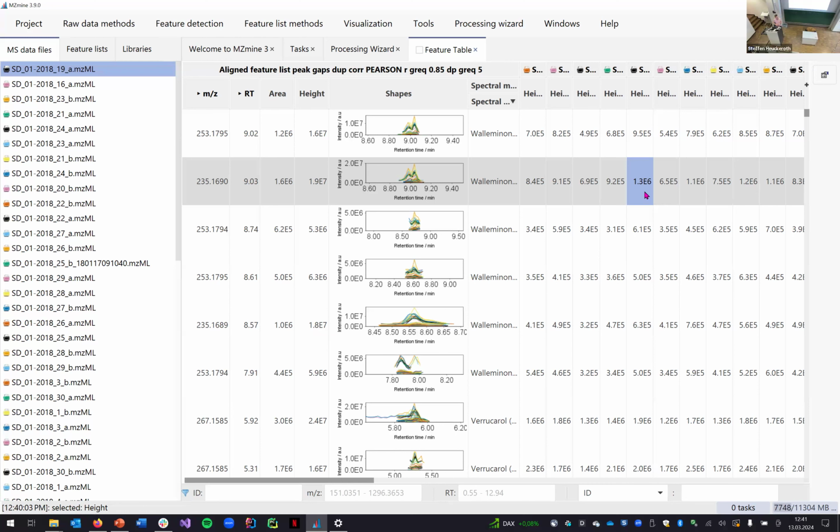I will write that down and keep that in mind for future developments. If I got your question, what you're asking, because you're an XCMS person, I see it. And I was also an XCMS person. So we know that in XCMS, we have this reduced feature table. I think that's what you referred to. You can reduce from 6,000, 10,000 features. And when you ask XCMS to produce a reduced feature table, you remove all the isotopes. And then you have only the most intense peaks, for example.